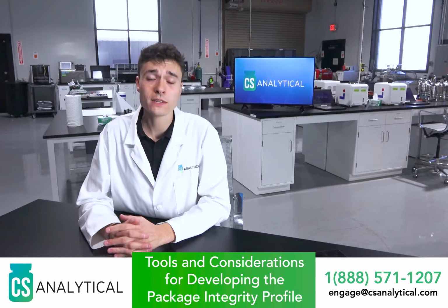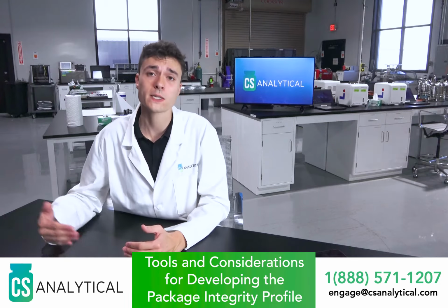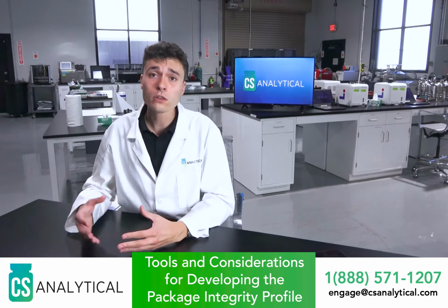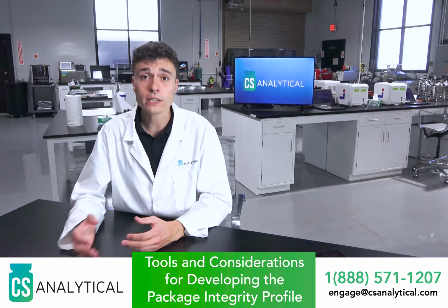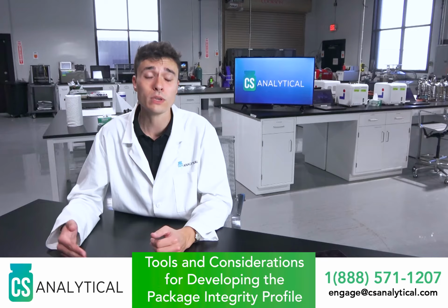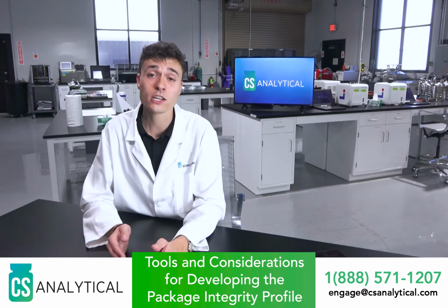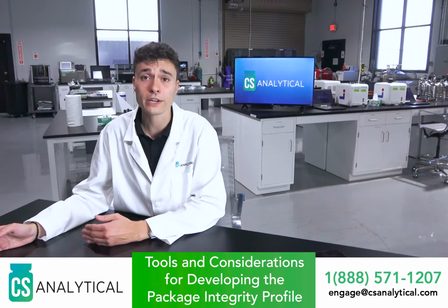Every package system has its unique considerations that we need to take into account as we develop and implement a CCI strategy. So that's why, for example, we have all of these different instruments that you see behind me under one roof. All of them are useful in support of container closure integrity testing. However, each technology, each instrument has a specific use case. Why and when we might use that instrument might be impacted by the product that's inside that package, might be impacted by that package system itself and the limitations that it imposes, but it can also vary based on your study goals.